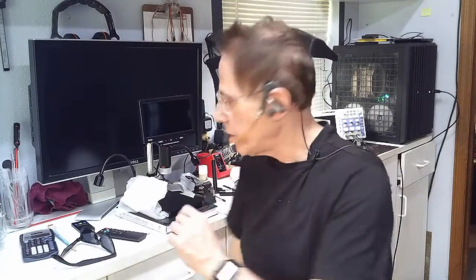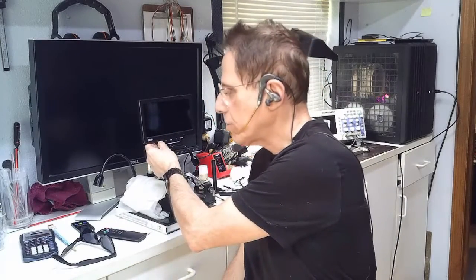Welcome to Reality Creative Video. I'm Hermes and I'm going to talk about some of the equipment I have here in the laboratory. The first thing I want to talk about is my video microscope.